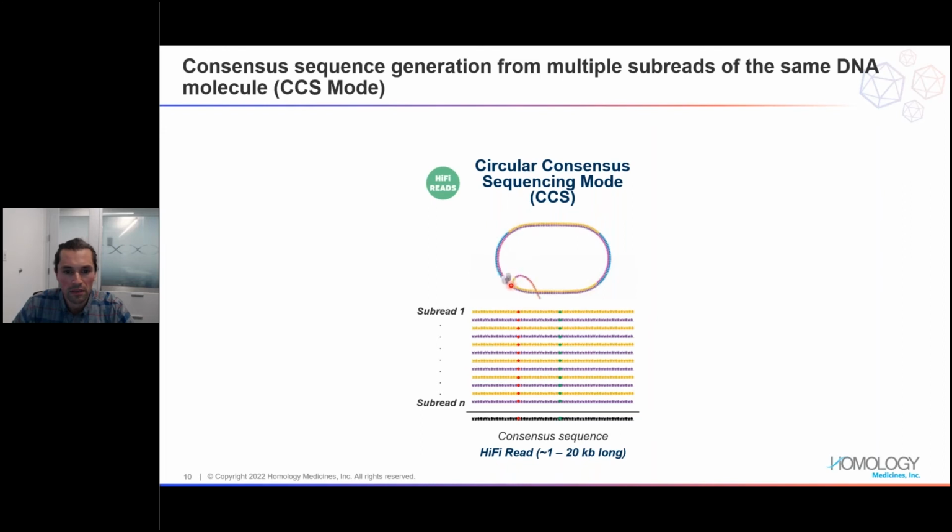And so you can see the polymerase displacing that newly synthesized strand, and it just goes around and around and around, creating what's called circular consensus sequencing. And so this gives us the confidence to know that what we're seeing is real. With these multiple passes, it doesn't really matter if you have one or two mutations, because overall you get this consensus that is built on many turns of the polymerase.